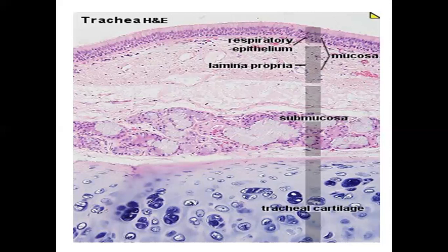Then after that we are coming to the lamina propria. هذه هي منطقة lamina propria of the trachea. At the lamina propria قلنا composing loose fibroelastic connective tissue containing lymphoid elements. ممكن أن نشوف فيها lymphoid elements. تمام. اللي هي تكون lymphoid nodules, lymphocytes والneutrophils.